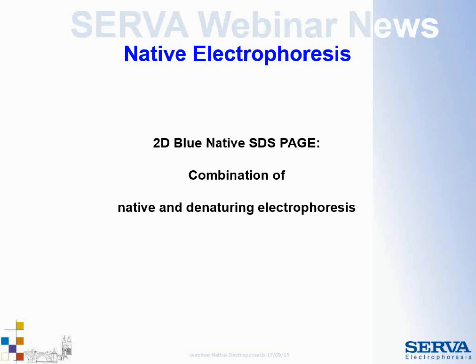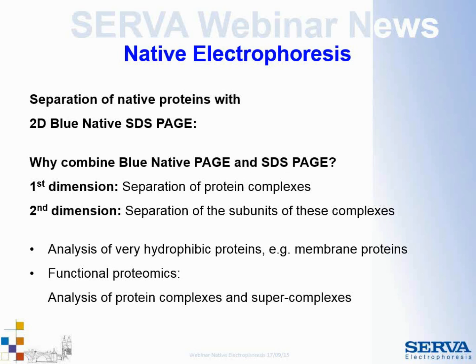A special application, which gives further information about the protein complexes, is the combination of native electrophoresis with denaturing electrophoresis. So it is the so-called 2D Blue Native SDS PAGE.